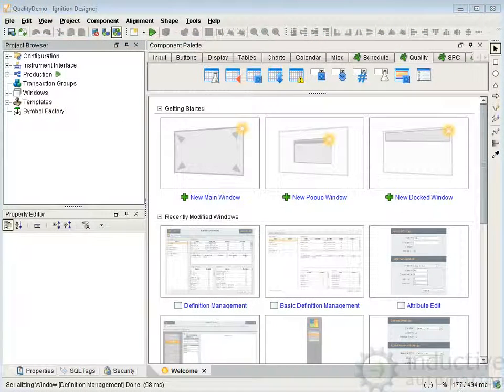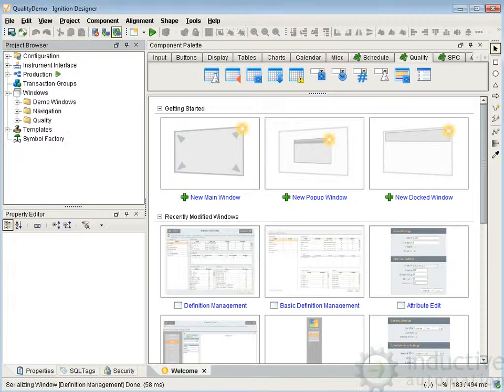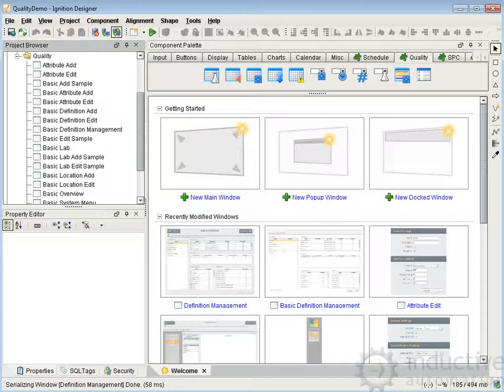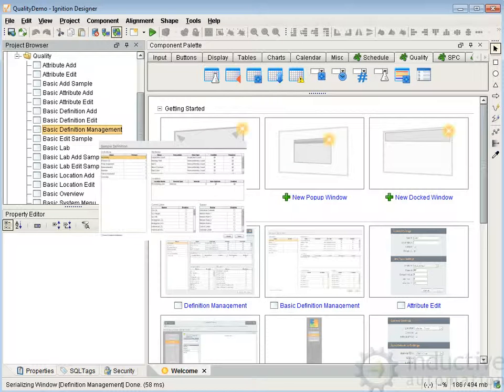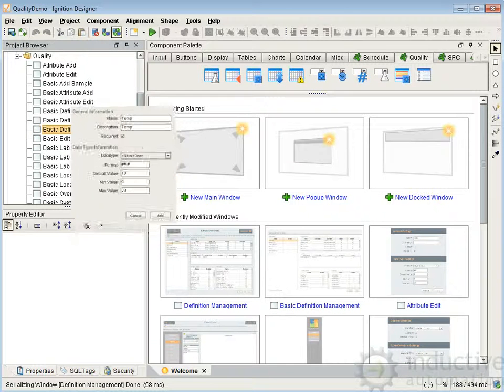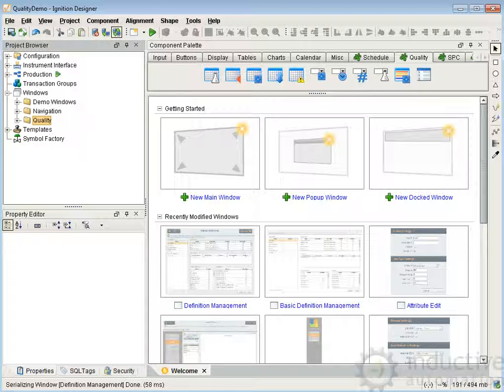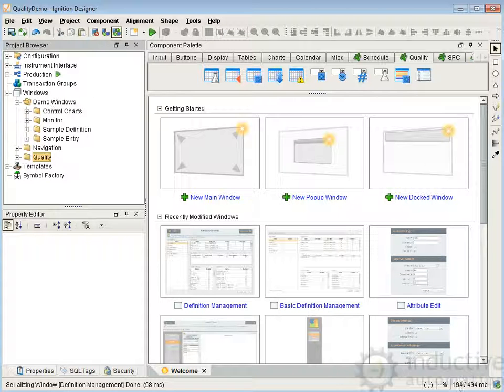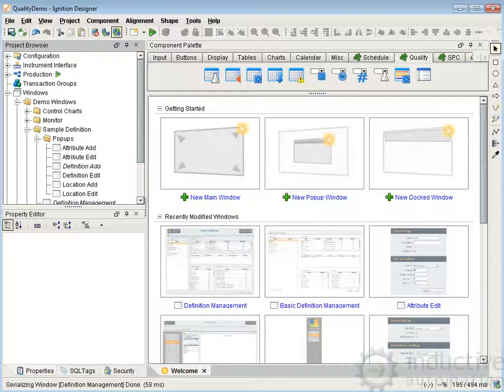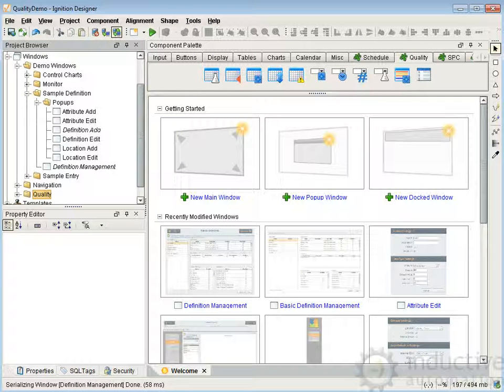Because there are a lot of pop-ups and other windows associated with the definition management screen, I'm going to go over the existing definition management screens in the demo. I have the demo project loaded here, and if I go into the quality section there's a basic definition management and then we see definition edit, attribute, things like that. If you have the full demo like what's up on our website, then under demo windows > sample definition we have the definition management and the pop-ups — it's a little better organized — so I'm going to use this area so it'll be a bit clearer as I'm describing it.